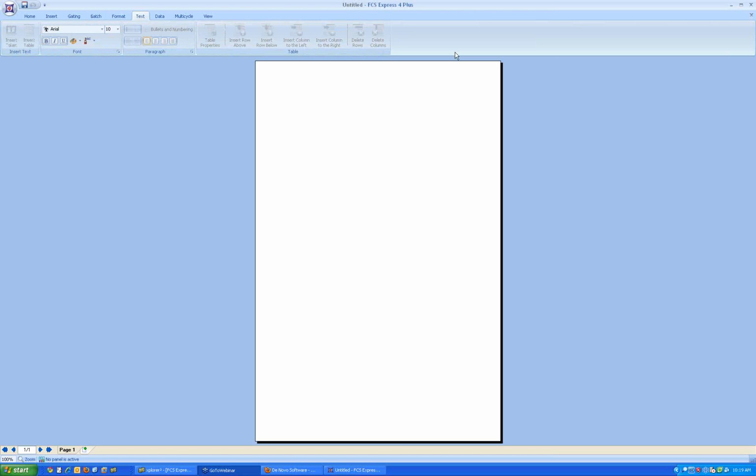I won't go into detail how the ribbon works. Just some key things that you can do with the ribbon. So again, you pick the tabs over there. The ribbon, like all ribbons, has a quick access toolbar. These are things here at the top that you can actually put up there that stay up there persistently.